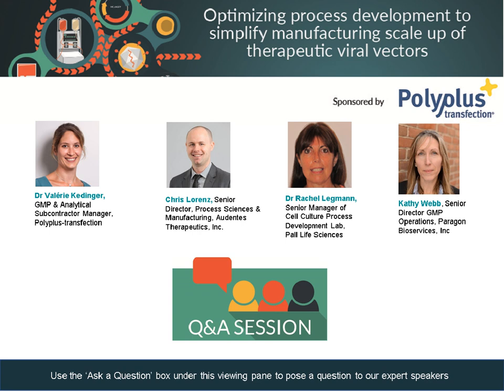Yeah, so to put it simply, the range of sizes of DNA PEIpro complexes is within 400 to 800 nanometers. And of course, this is a discussion we've had, notably with Paul and with Rachel, regarding how you can dynamically follow the size of the complexes, which can be a measurement to see the impact on transfection efficiency as you're scaling up. So that is one measurement that one can use to check that the complexes are within the optimal size to reach highest transfection efficiency.